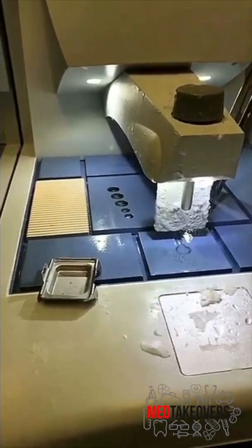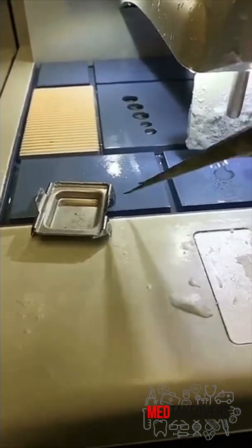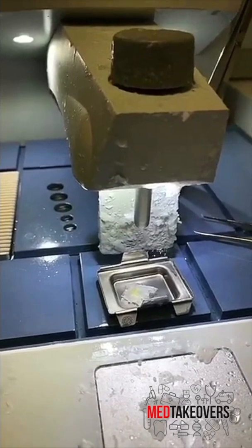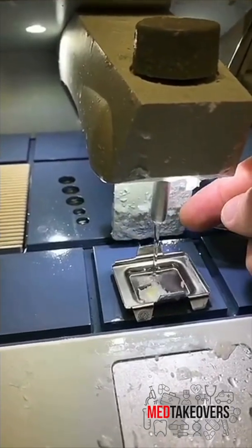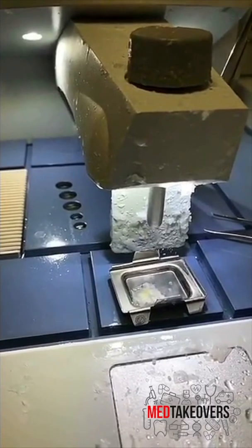After the tissue processes, we have really experienced histotechnologists who take the tissue out and put it into a little container and fill it with hot wax. This step is called embedding because you embed the tissue in hot molten wax and then it cools and solidifies into a block.